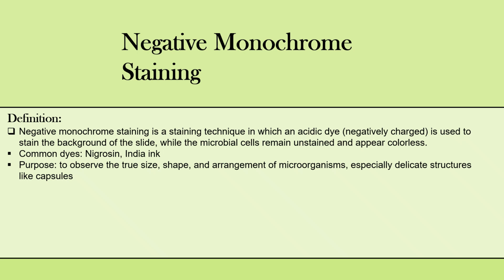The purpose of this is to observe the true size, shape, and arrangement of microorganisms, especially delicate structures like capsules. We observe special structures like capsules with this staining method.